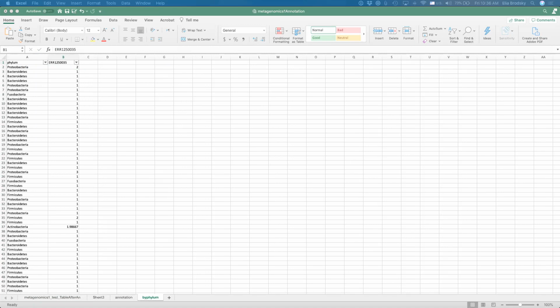Okay, so for those of you that don't have this file and are struggling to create this file, since we're going to be using this file, I'm just going to give you this file so that you can have it.